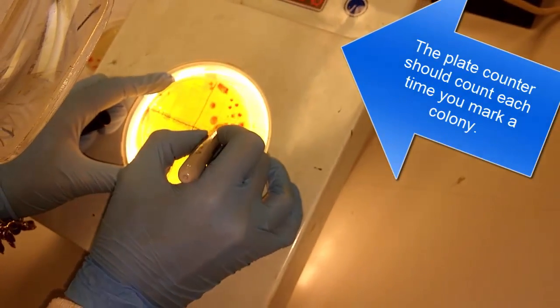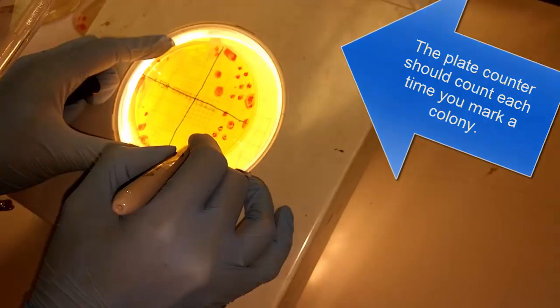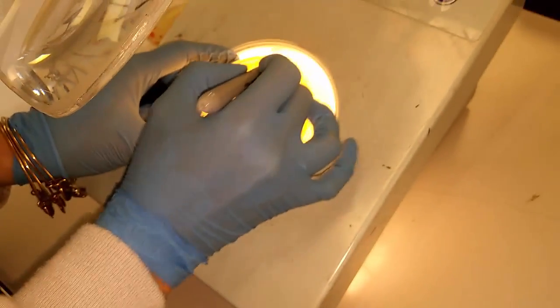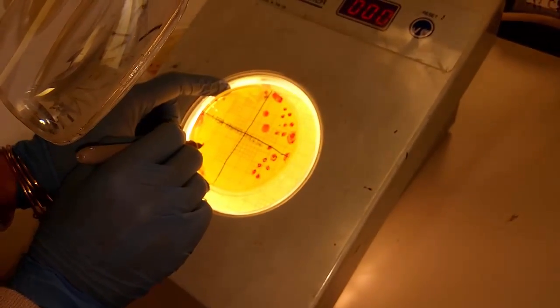The colonies are counted by marking each colony with a dot on the bottom of the plate. At the end of the procedure, all plates should be placed in an autoclave to kill any bacteria present.